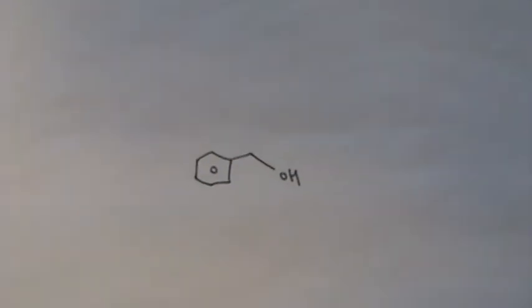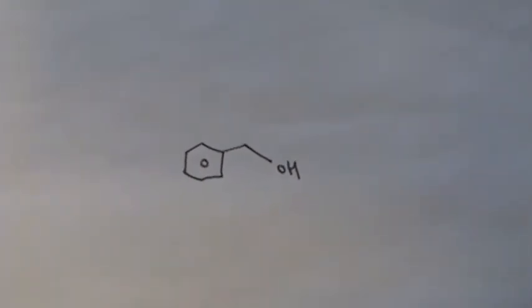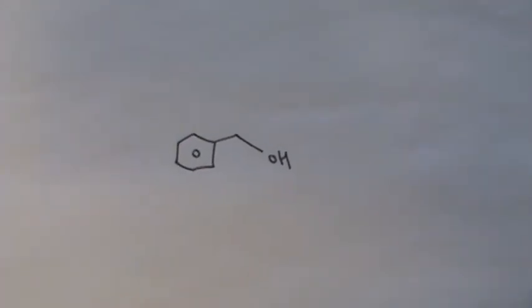So that was benzoic acid. Turns out I do not have a carbon spectrum of benzyl alcohol handy. You guys should be able to handle that. I'm sure you can find one on the internet. Maybe I put one on a blackboard and I don't know about it, but at the moment I don't have a carbon of this beast. But I have a variety of different past students' protons of this, okay?